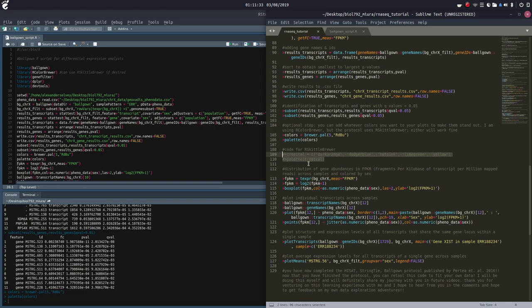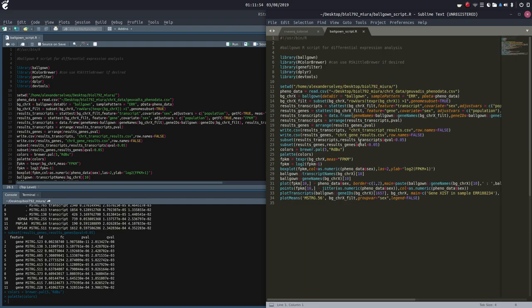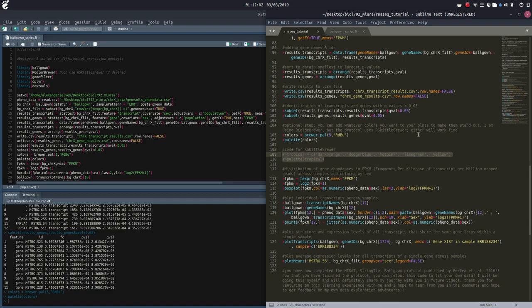I will update the RNA-seq tutorial — I'll copy-paste this into the comment box below so you can copy-paste it into your own text file. I'll also link this ballgown script so you can copy-paste it into your own text file and load it up into R without all the annotations if you desire.